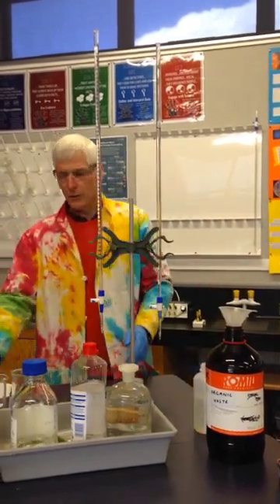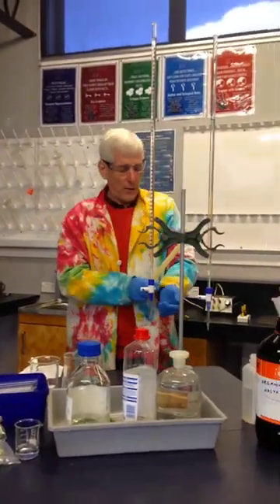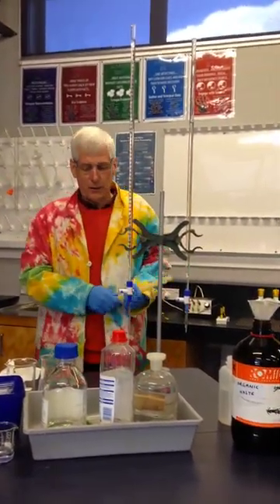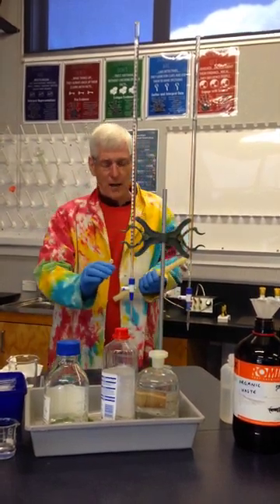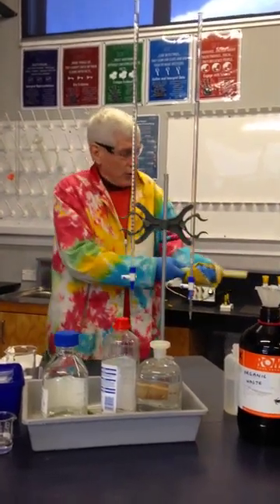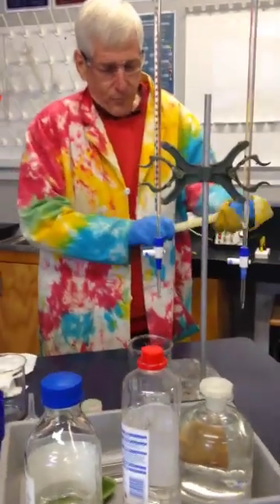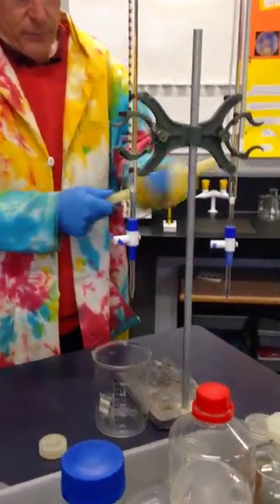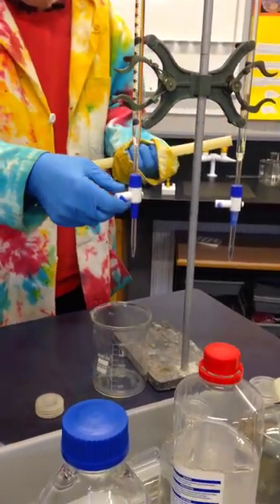So what I'm going to do now is take this plastic rod, and I'm going to rub it on my lab coat, and I'm going to allow the water to stream out, and I'm going to bring the rod close to this. Now you saw this the other day, and it worked nicely. So we'll see if this works.